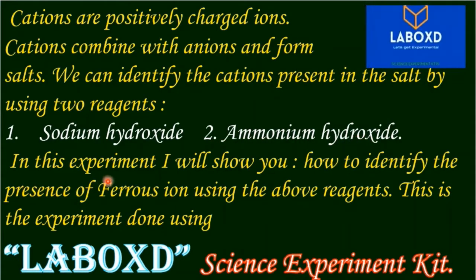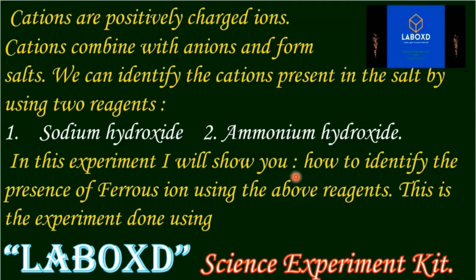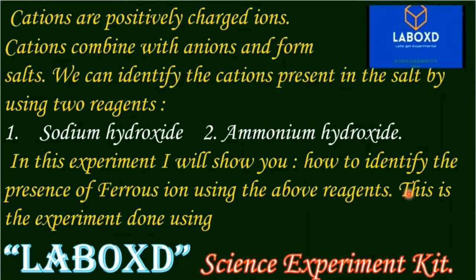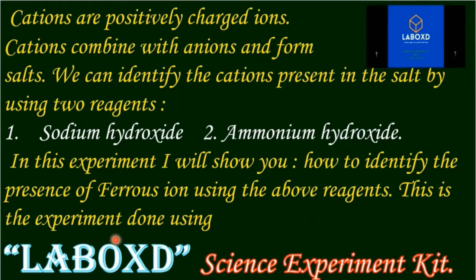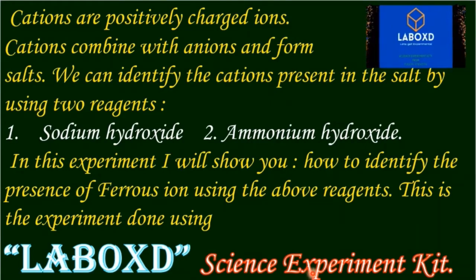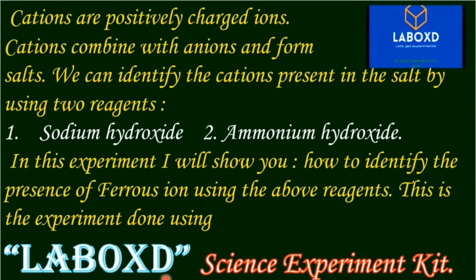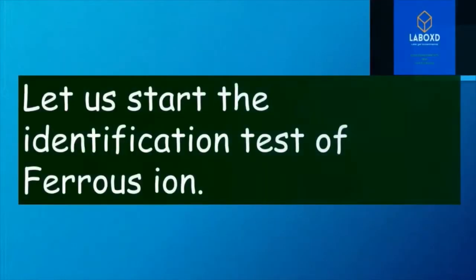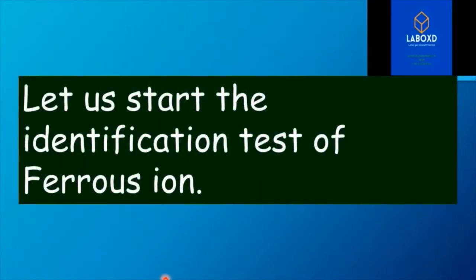In this experiment, I will show you how to identify the presence of ferrous ion using the above reagents. This is the experiment done using the LaboxD science experiment kit. So let us start the identification test of ferrous ion.